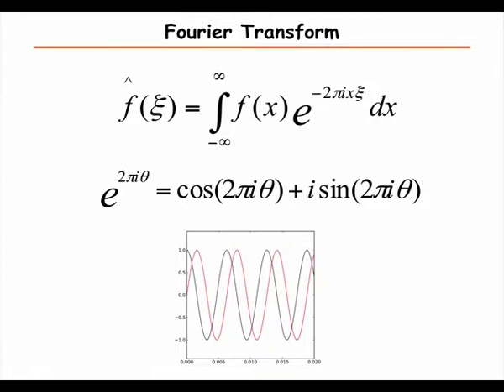What we can do is apply what's called a Fourier Transform to these waves. It transforms a wave from the time dimension into a frequency dimension. There are two parts to it.